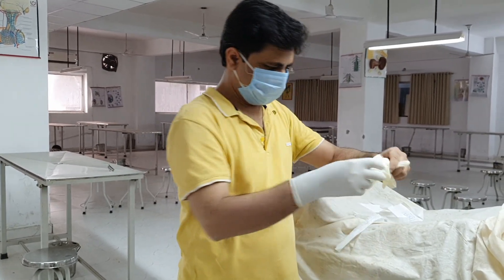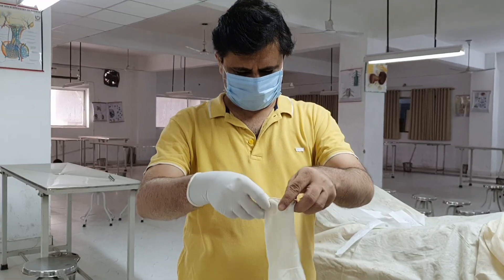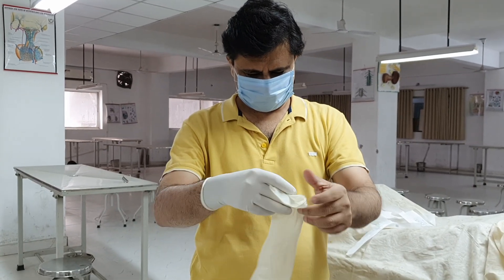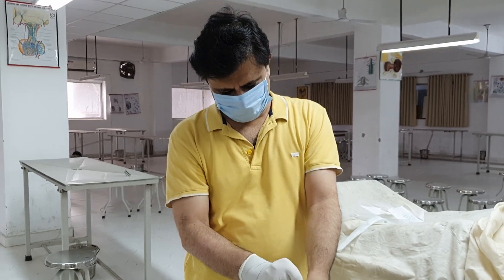When you wear a glove, first of all stretch it like this and then roll it like this. This fills air in the digits, so they don't become sticky. It is easier to wear.